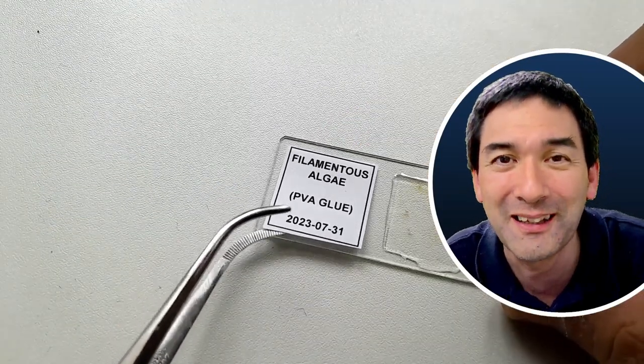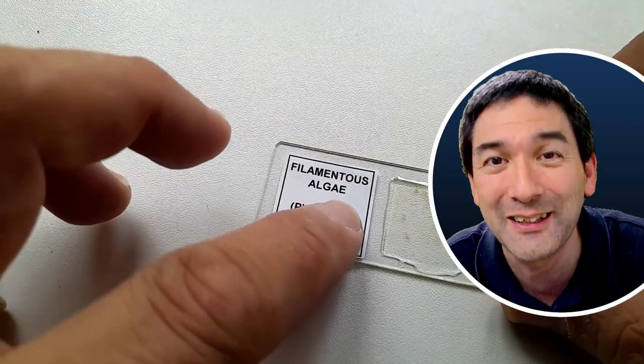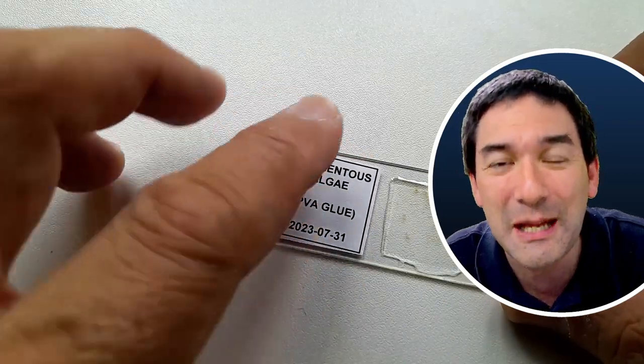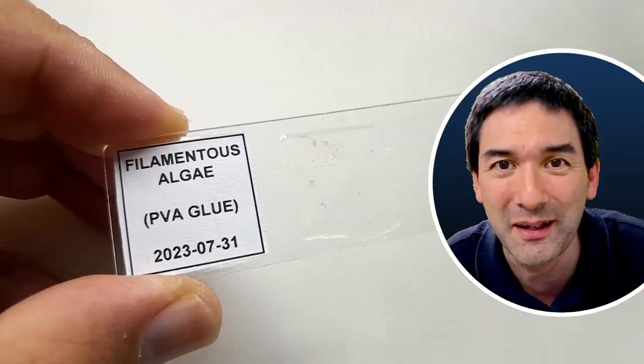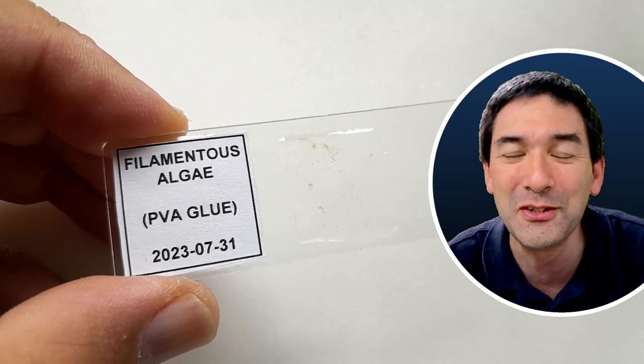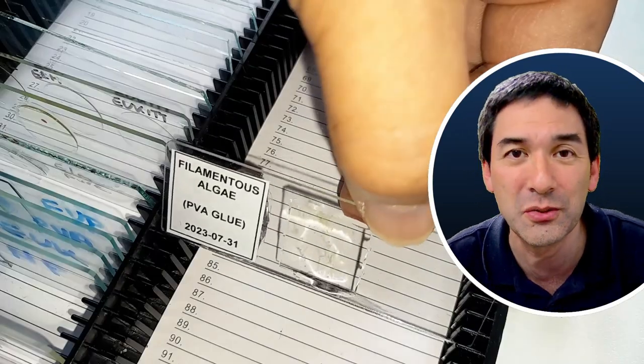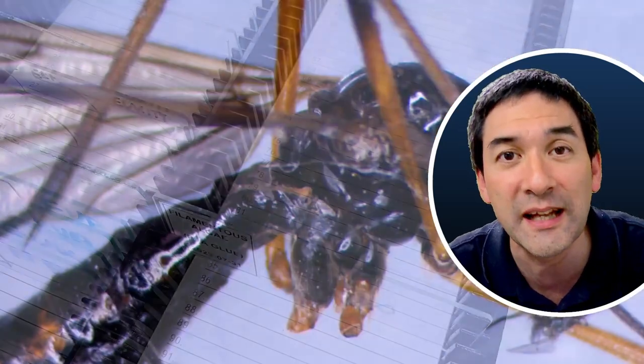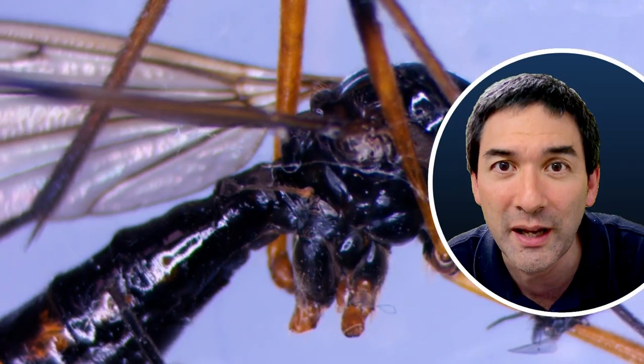The mounting medium can also be used to connect and glue a little label on the microscope slide as well. Then everything can go into the box, but I would like to advise you that you first store the slide horizontally so that it dries completely.